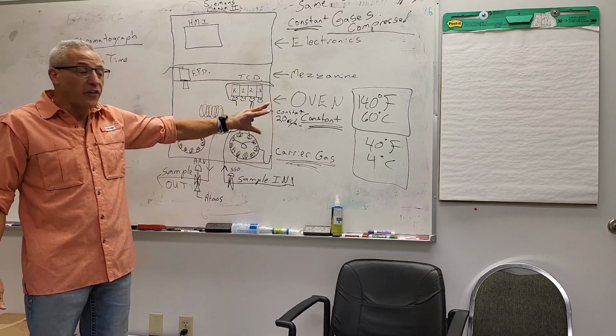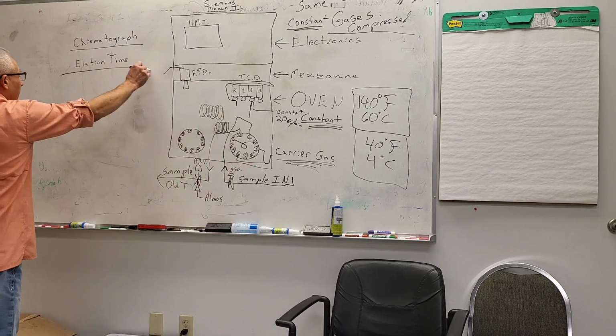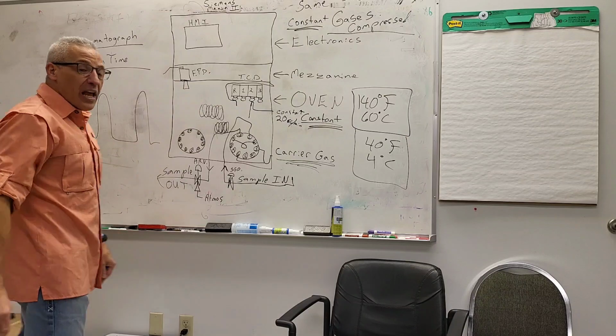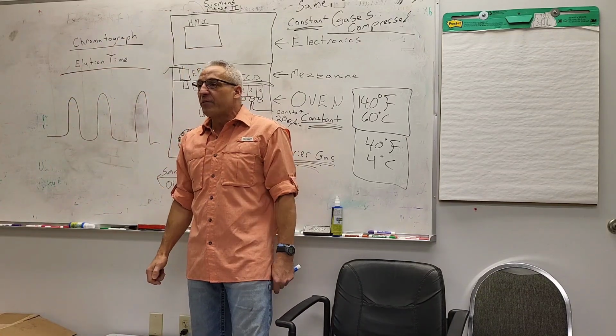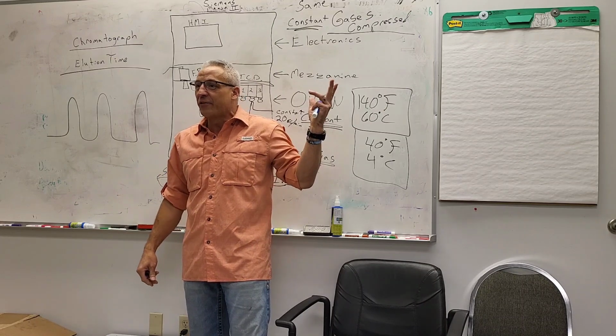Once we set this flow, and it is a constant, everyone will elute out at the same time, same bat place, same bat channel, every single time. Y'all don't know what that means, but back whenever there was Batman on TV, they'd say, come back next week, same bat place, same bat channel.